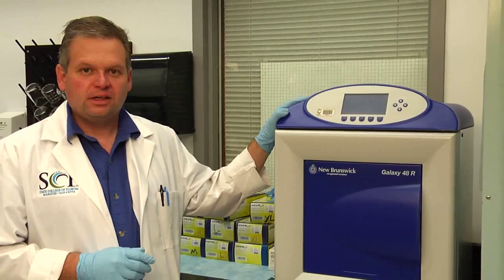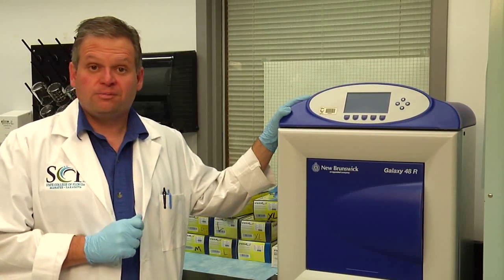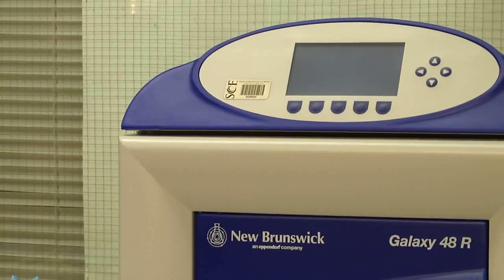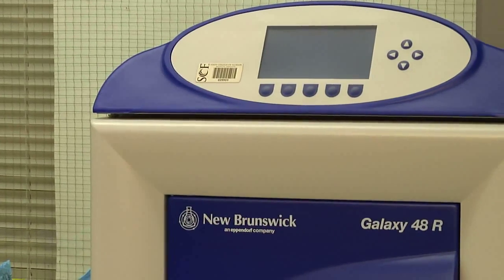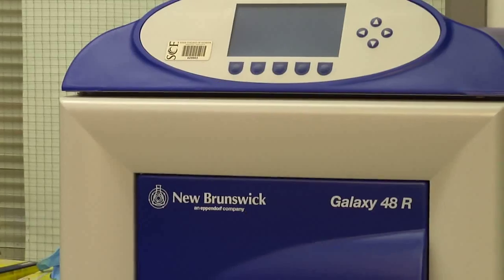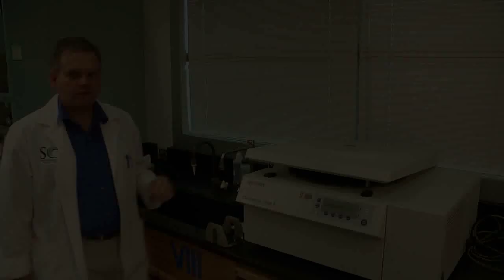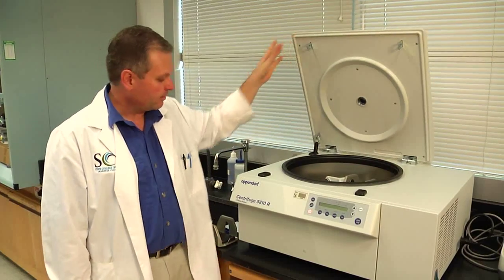This is our CO2 incubator — another new piece of equipment for this program. It is basically going to allow us to do cell culture. Cell culture is a set of techniques and methods that I didn't even get to do until I was in graduate school. So this is another one of the exciting pieces of equipment we have for our program.